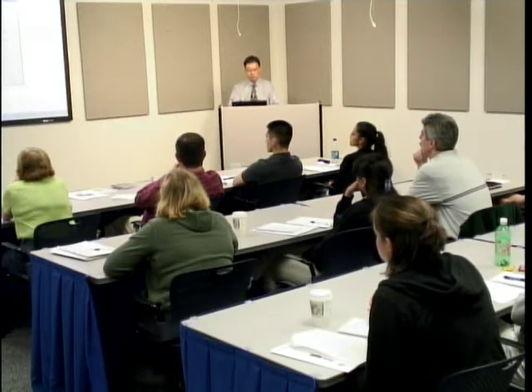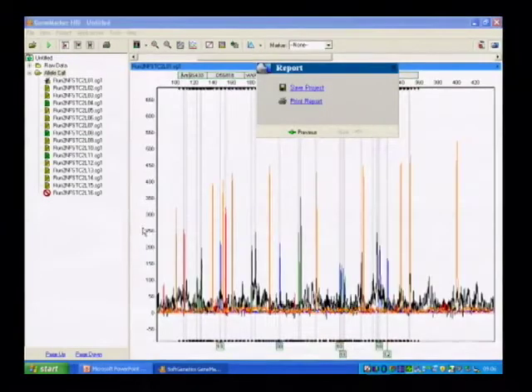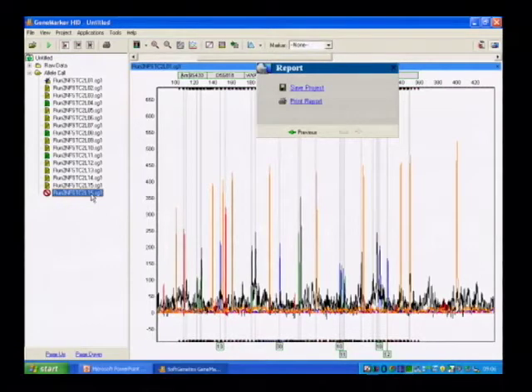Since we already created the virtual ladder, or the Allelic Ladder, I'm going to click off this button, and then it'll just go through. What it does is first call the sizes and then call the alleles. First of all, you see lane 16 has failed, because that's the matrix standard. There wasn't any sizing standard associated with it, and it couldn't find it, and it was unhappy.